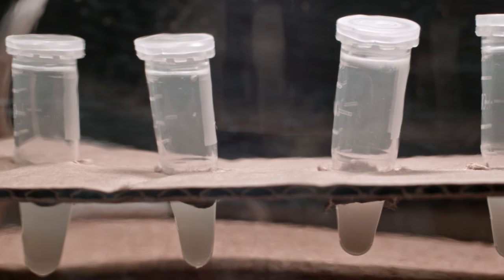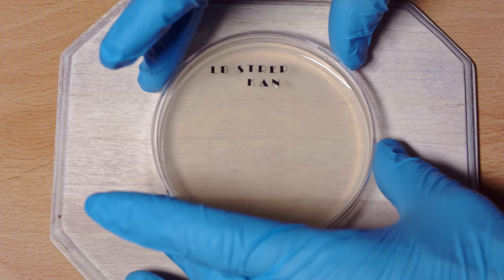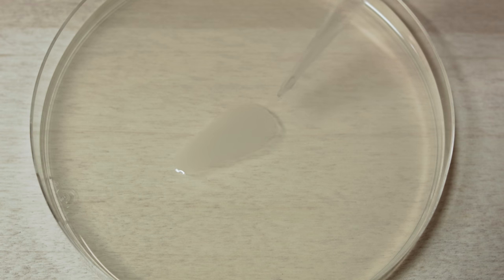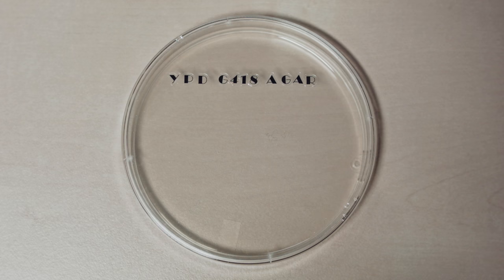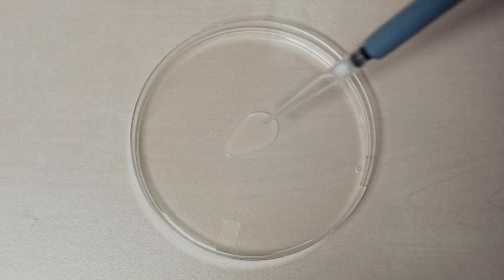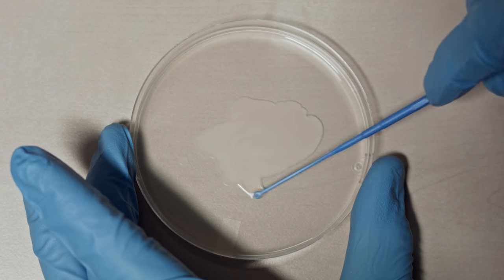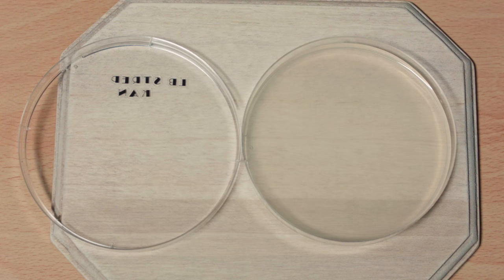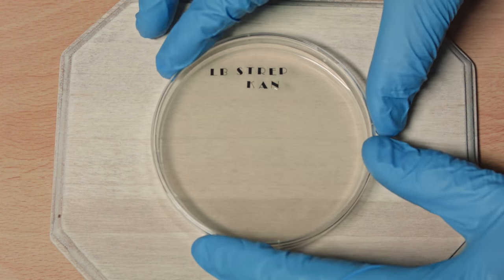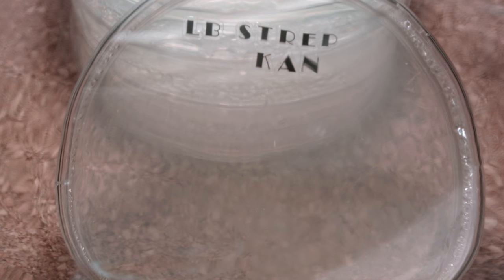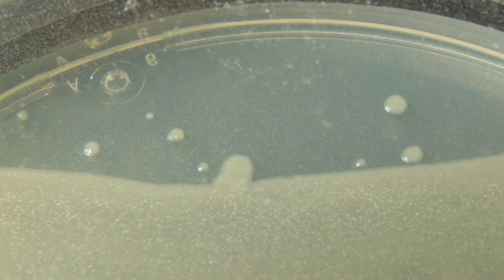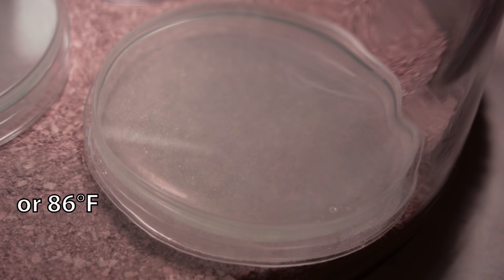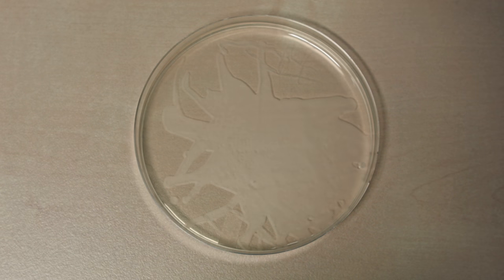Now it's time to see if the yeast and E. coli have been successfully engineered. On an LB Strep-Kan plate, pipette out 100 microliters of the E. coli competent cell mixture. Discard the tip. And on a YPD G418 plate, pipette out 400 microliters of the yeast mix. Carefully streak out the E. coli and yeast with an inoculation loop or a plate spreader. Let the plates dry for 10 minutes, then put the lids back on and flip it over. Incubate the E. coli one last time at 37 degrees Celsius for 16 to 24 hours, or 48 hours at room temperature, and 30 degrees Celsius for the yeast for 1 to 3 days or 2 to 4 at room temperature.